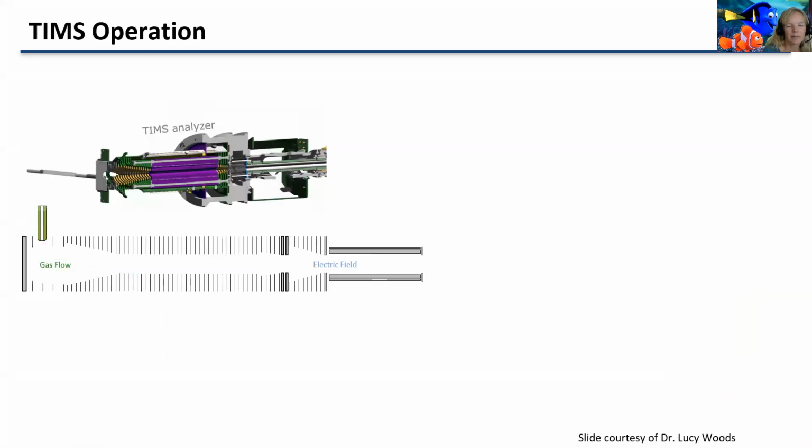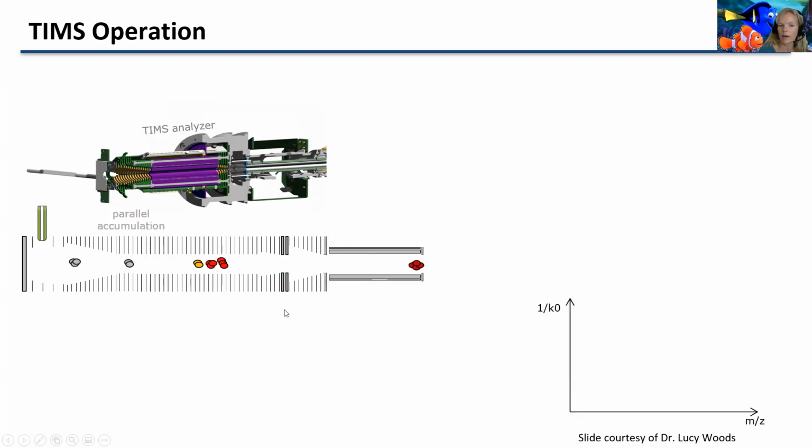So here I'm going to stop it first. This also has a gas flow in the system. The gas flow is going to push your molecules to this analyzer region where there's an electric field that's pushing them back. It doesn't want to let those out. And so this is that analyzer section. Here, your molecules separate by mobility and you start ramping them out of the instrument. And what happens is actually the biggest ones come out first based on the way that they do the separation.